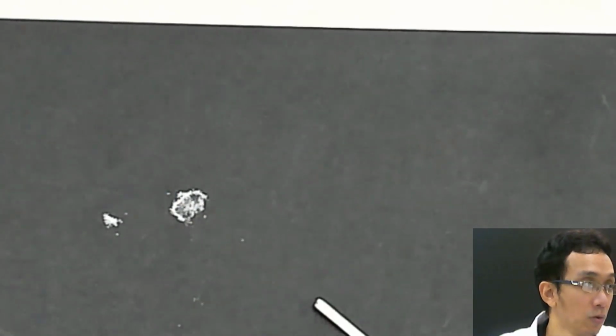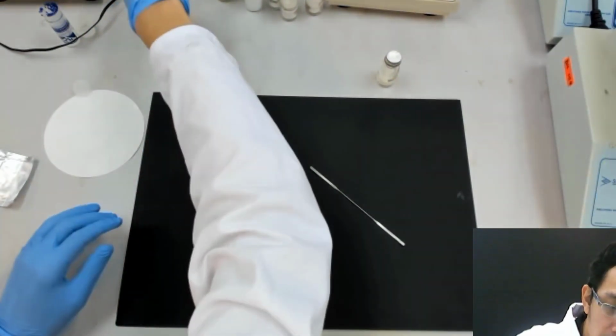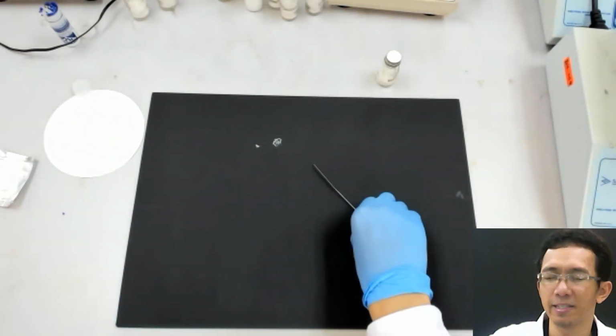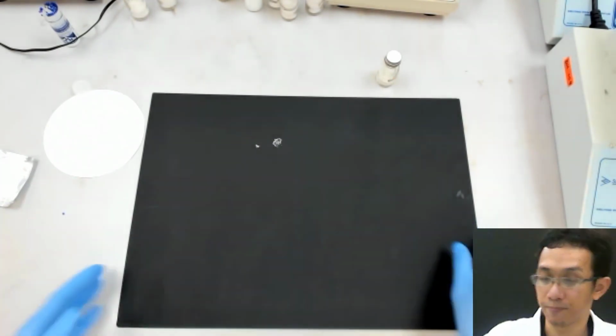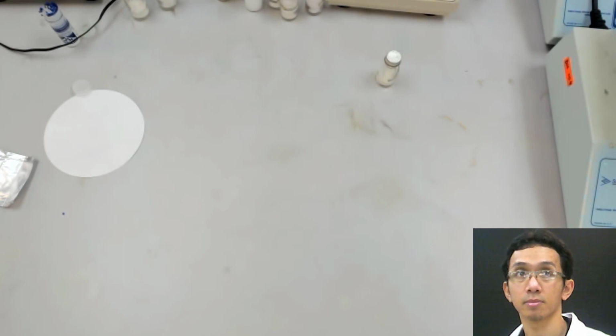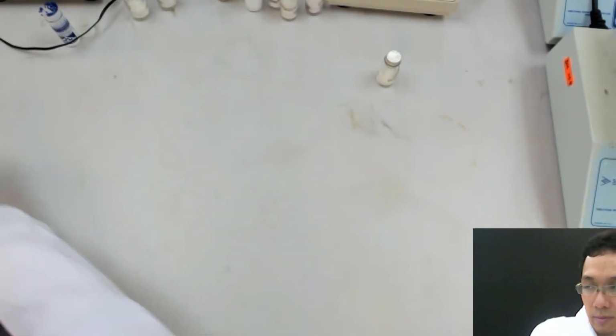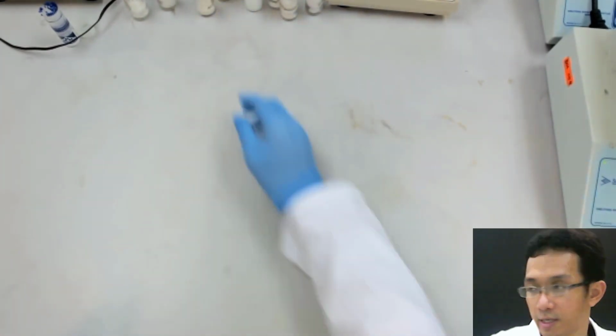So now let's do the second part, the recrystallization part. So we put it over there. The recrystallization part is quite quick. You're not waiting like just now. So what do we do? Recrystallization.